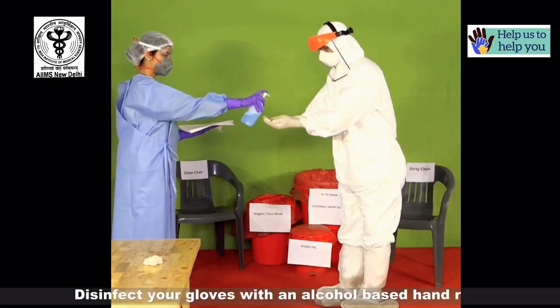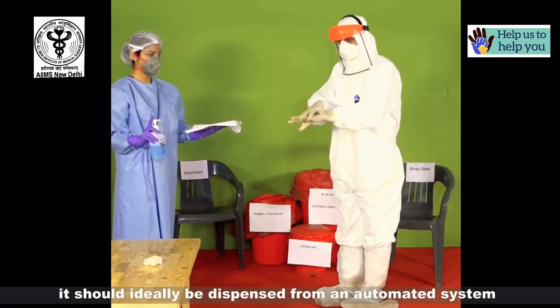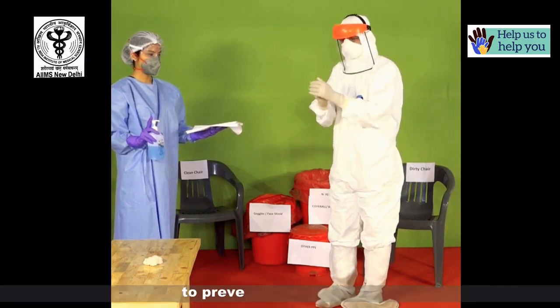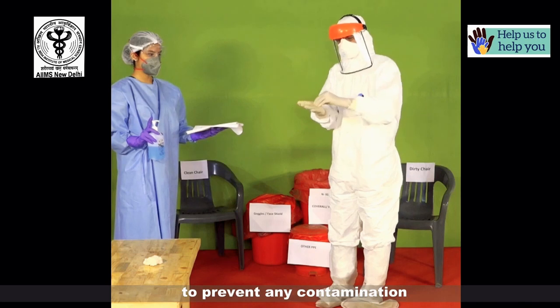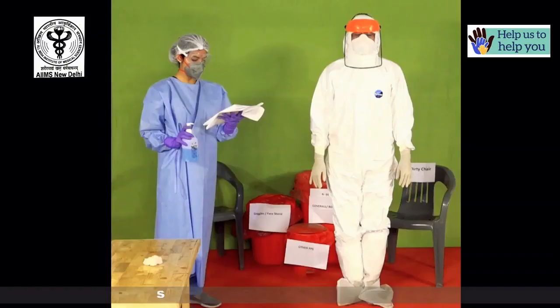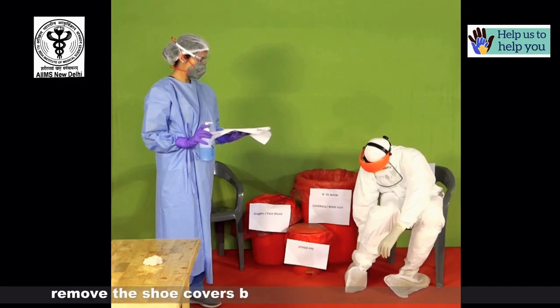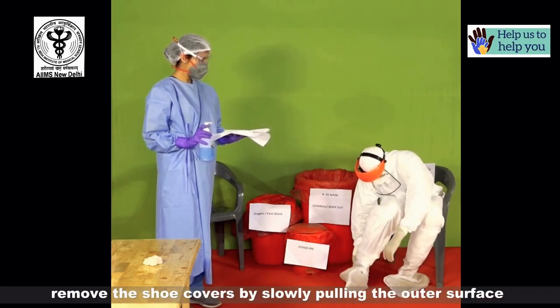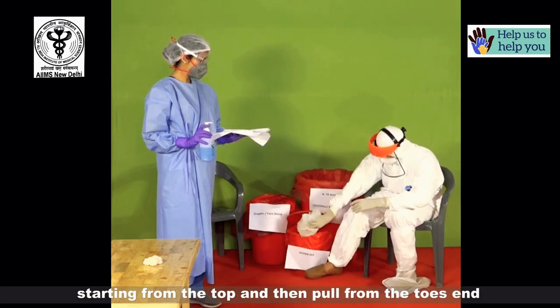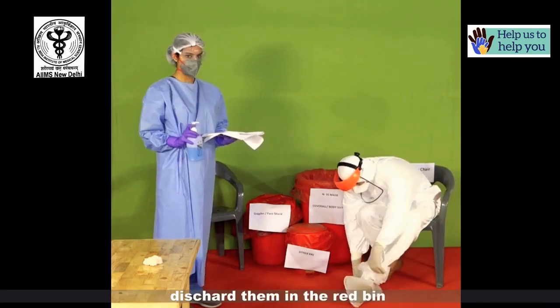Disinfect your gloves with alcohol-based hand rub, ideally dispensed from an automated system with the help of your buddy or by pressing the nozzle with your elbow to prevent contamination. Sit on the dirty chair with legs apart. Remove the shoe covers by slowly pulling the outer surface starting from the top and then pulling from the toes end. Try not to cross your legs while sitting. Discard them in the red bin.